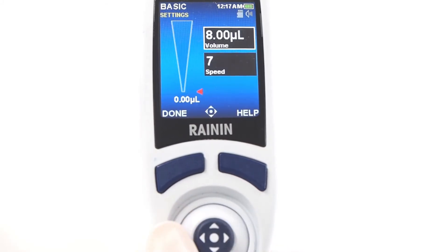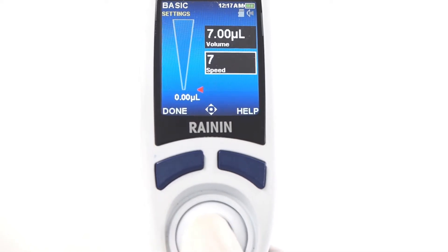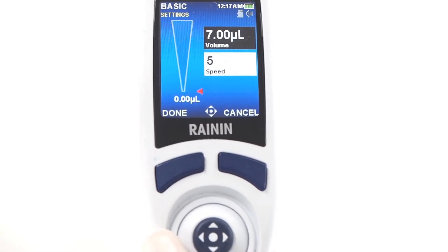To adjust settings, joystick right. To modify the value inside a highlighted box, press the joystick in. Left and right move in larger steps; up and down, finer increments. When a value is correct, press the joystick to set it and move on. You can also press done. When all values look good, press done to exit settings.